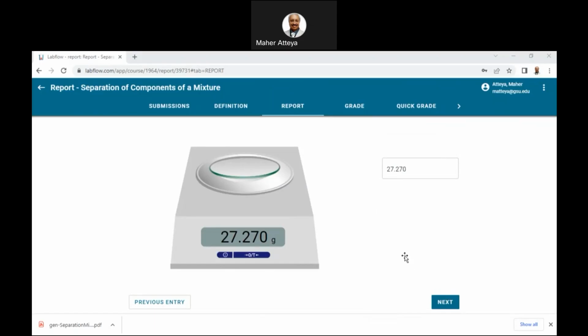Okay, so now if you look at the theoretical background, if I go back all the way here, just to tell you this, the unknown is made of, here our unknown.